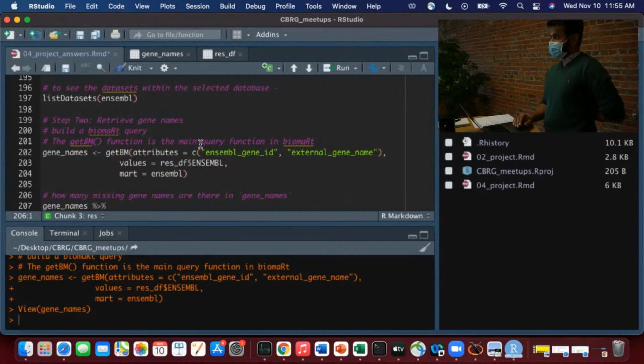Any suggestions? Is there a count function? You could.